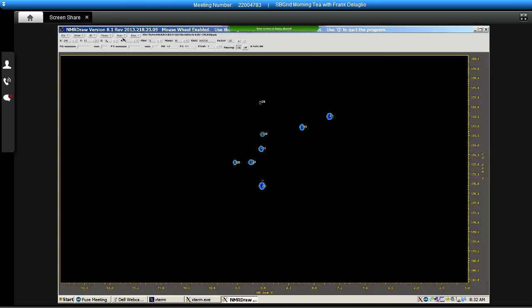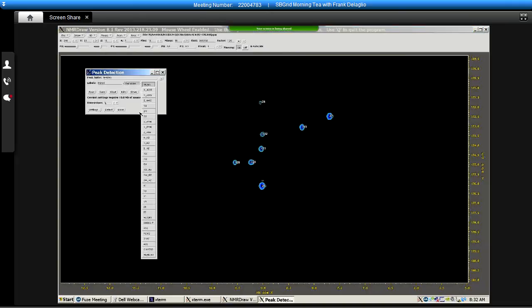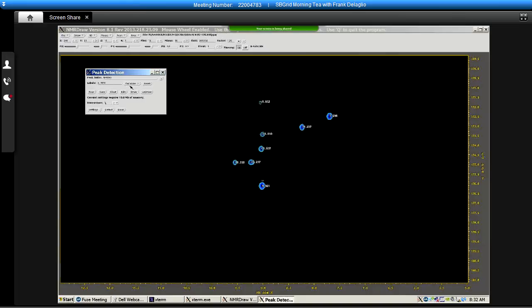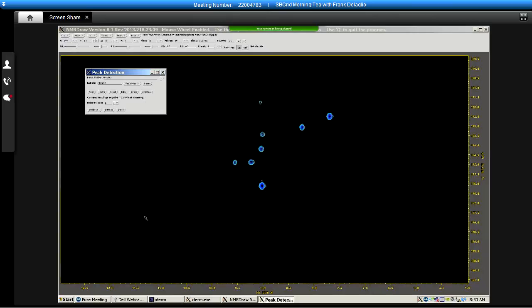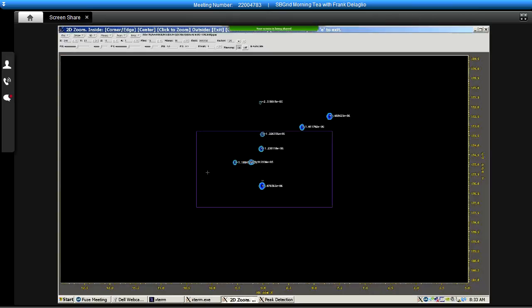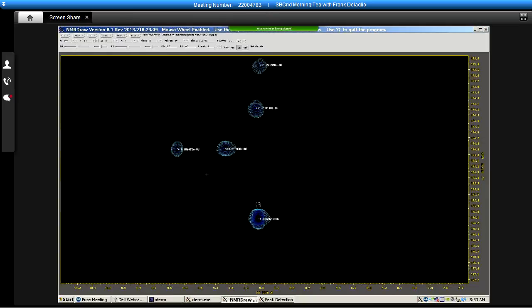Very simple. And the peak detection program records all manner of parameter estimates for the peaks, which we can display on the screen, like the chemical shifts in a particular dimension, or the height of the peak. All that's saved in a simple text table. So those are the basic steps for going from raw spectral data to a finished spectrum and a peak table.